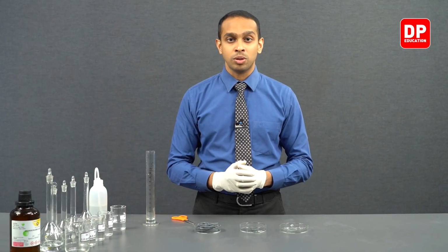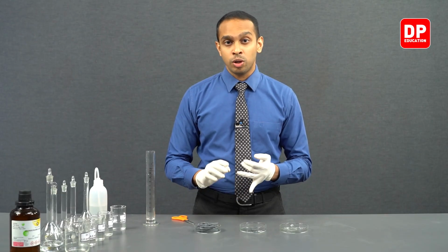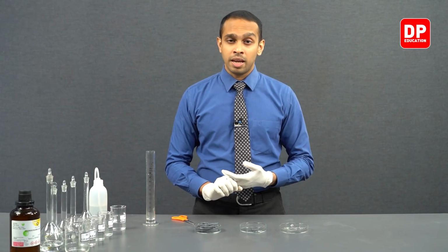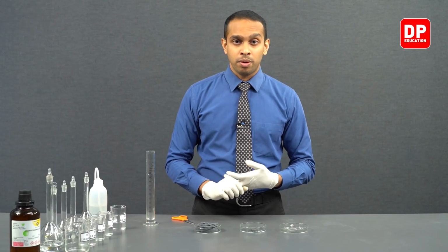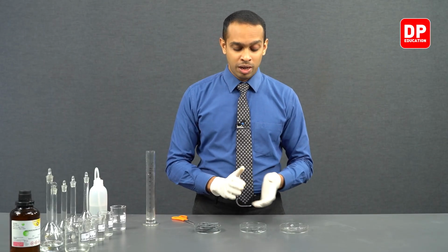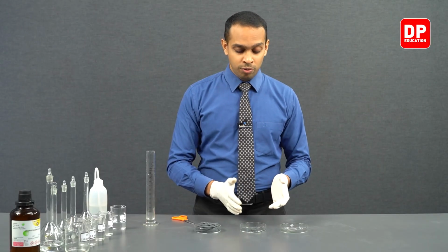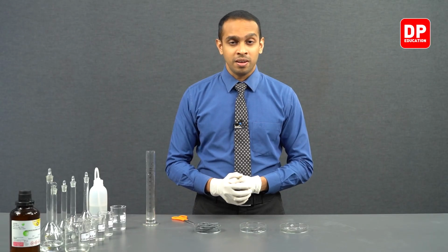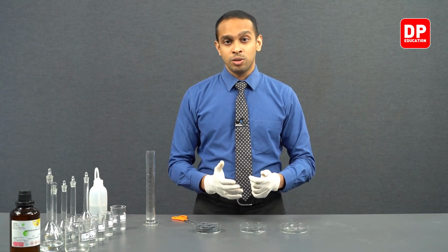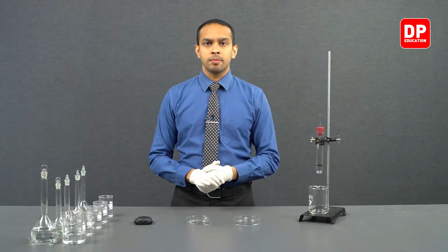So we try our best to keep other factors, such as temperature, the volume of hydrogen gas that is collected, and the surface area of the magnesium strip that is exposed to the HCl, a constant. So now we have cut 5 pieces of magnesium with equal length. So we can now move on to adding these magnesium strips to a rubber stopper and conducting this experiment.